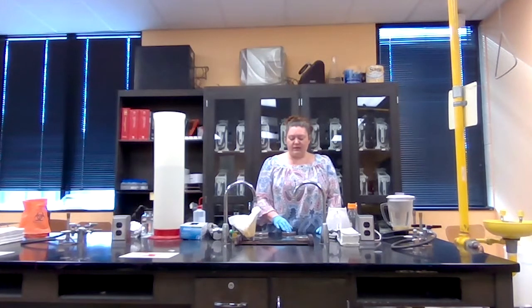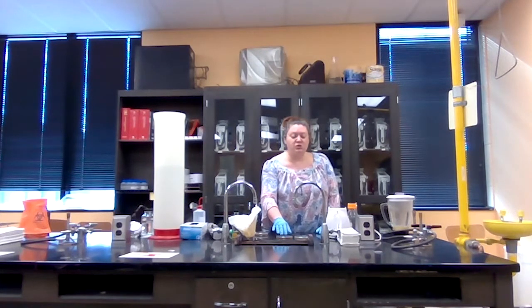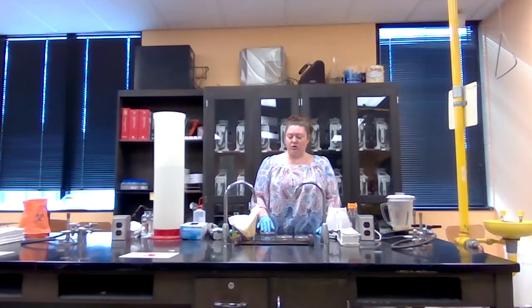So when you're doing this, that's why the dilutions are important, because you can do math later to be able to determine how many microbes are in your original solution by kind of backtracking with your dilutions that you made of your original sample, and using the number of bacterial colonies that you counted. So the colonies are going to be individual dots that you're seeing on petri plates. And each colony represents one cell that was in the original sample.